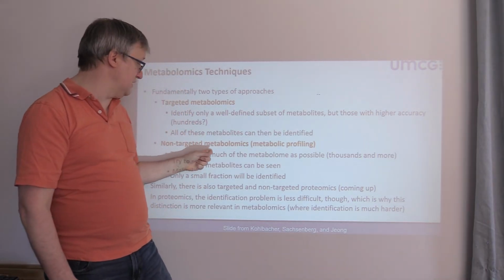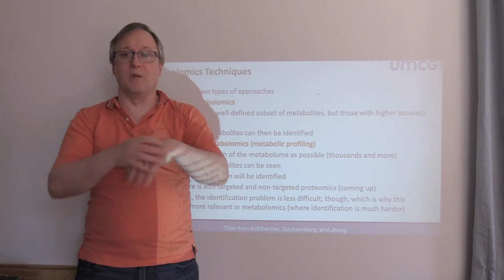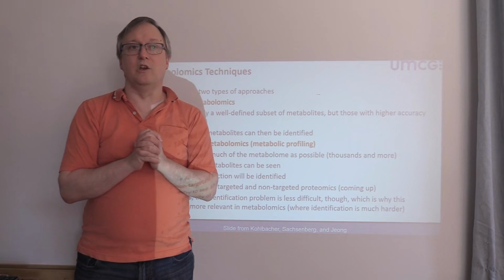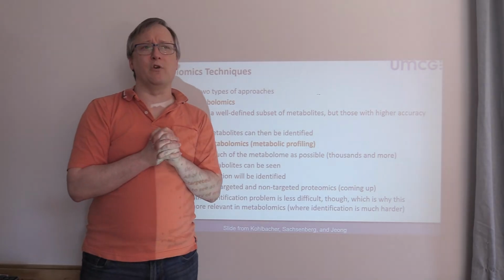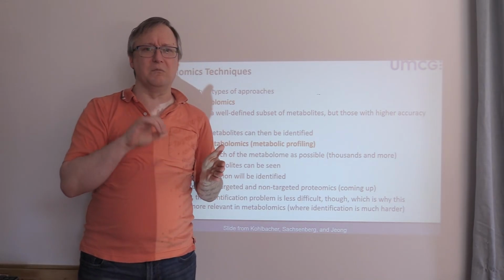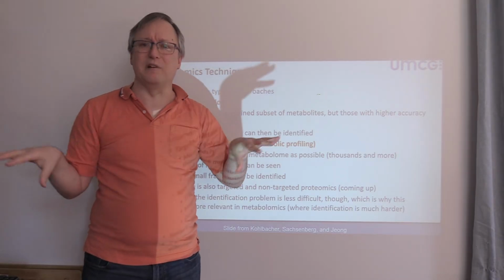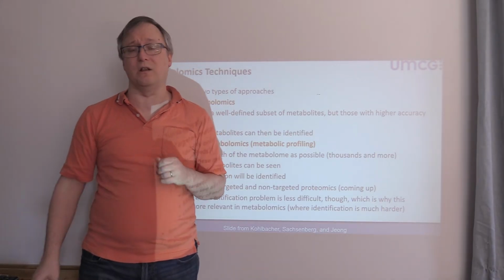That's quite different when we get down to untargeted or broad metabolomic profiling. In a case like this, we already have to make some choices. You're not going to be studying lipids at the same time as you're studying small polar molecules. They have quite different behaviors in separation and quite different behavior in mass spectrometry as well.